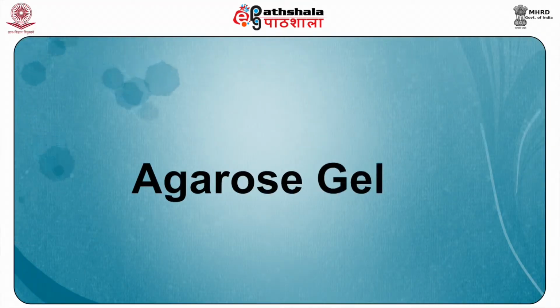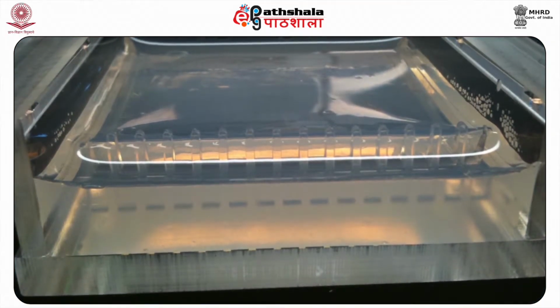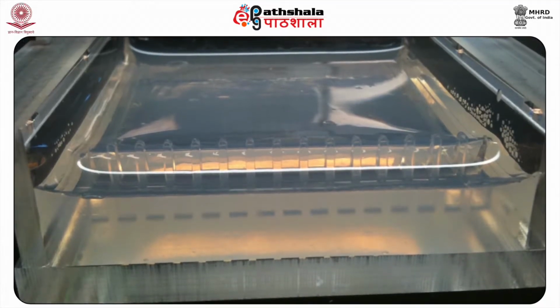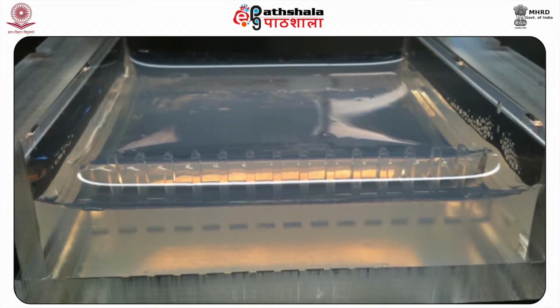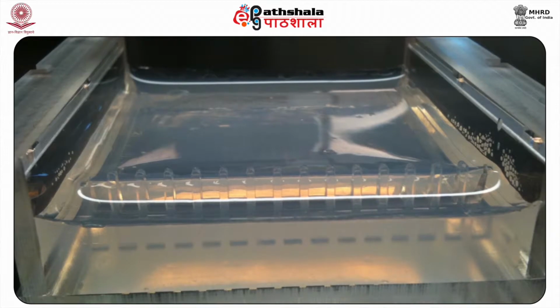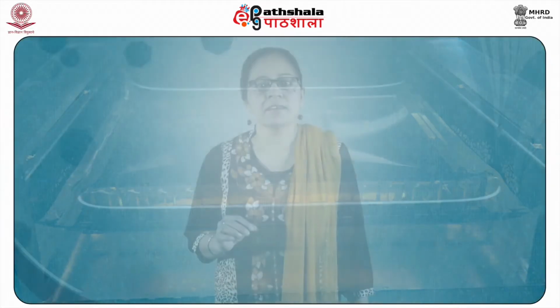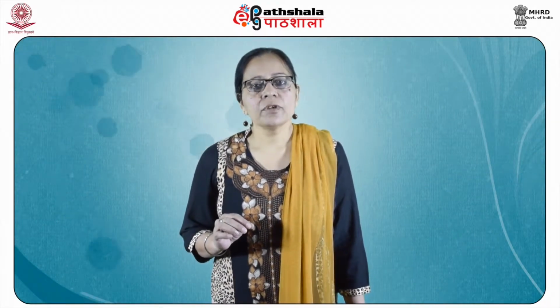Agarose gels. For separation of large proteins, agarose gel is used. Agarose is a derivative of agar and is a highly purified polysaccharide. It is normally purchased as a dry powder. Heating the suspended powder near boiling helps it to dissolve, and it remains liquid until 40 degrees centigrade, when it gels or sets.